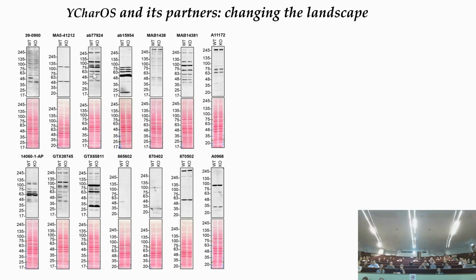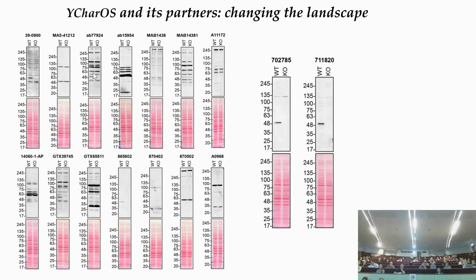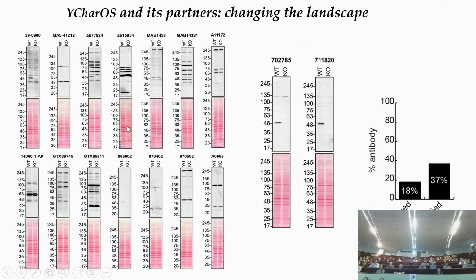We presented this data back to our partners, and one of them came back and said, look, here's a business opportunity for us. They went out and made 2 recombinant antibodies. Look at that. Thank you, Matt and Thermo. And these antibodies work brilliantly, and my understanding is they're doing quite well. The Michael J. Fox Foundation is now telling their investigators, if you're going to do Western blot, stop using those ones, you've got to use these ones. And in fact, our manufacturing partners have started to either remove or modify their recommendations on their antibodies based on the feedback they're getting from us.